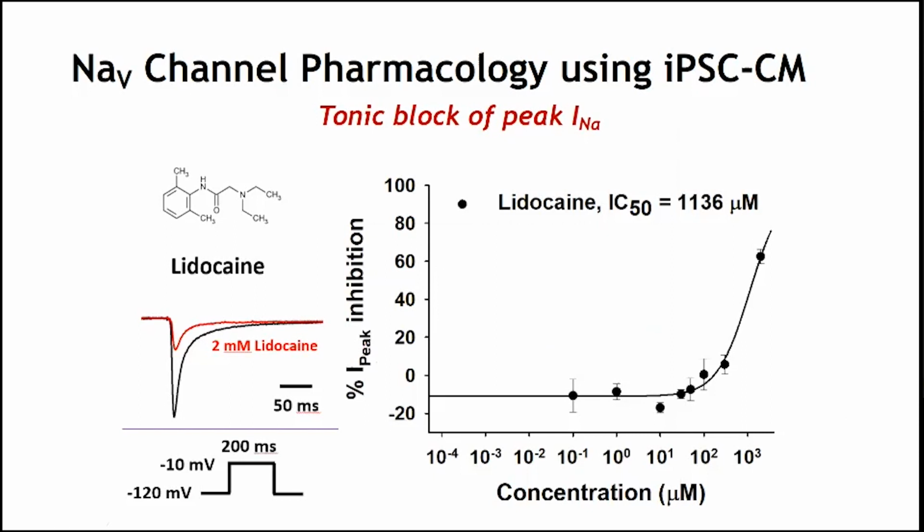I won't go into detail, but we were able to look at tonic block of peak sodium current and use-dependent block, and used, in this case, 5 different drugs and compare them across several concentrations. This work would have taken a long time to do by manual patch clamp, and there's no way we'd have been able to gather the robust data sets that we were able to do this work.